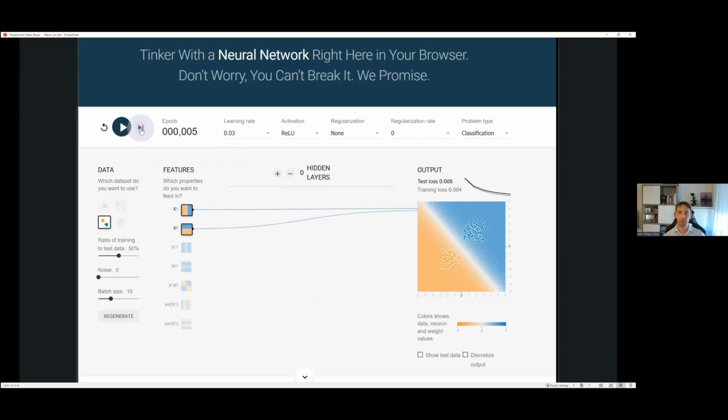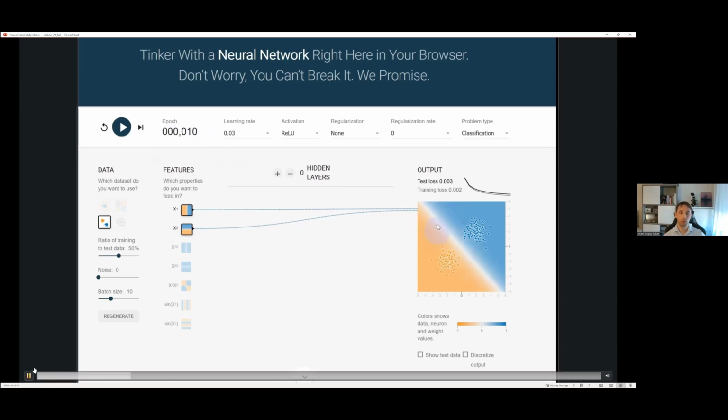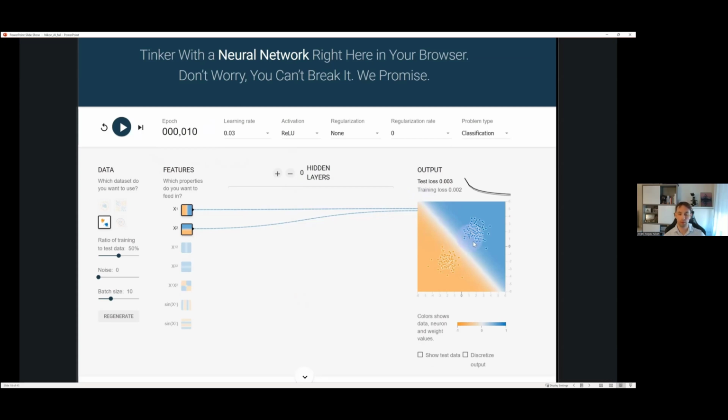You can see our training loss is very small already, and we found our function which divides the region to very easily predict whether the point will be positive or negative. And here it's also an interesting point that we used machine learning here. However, from high school statistics, you know that we could have done just a very simple linear fit. It would give the same result.